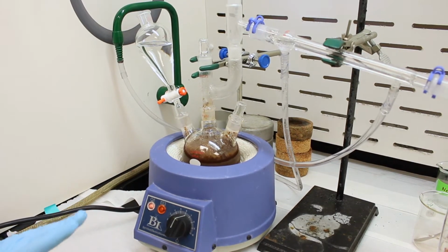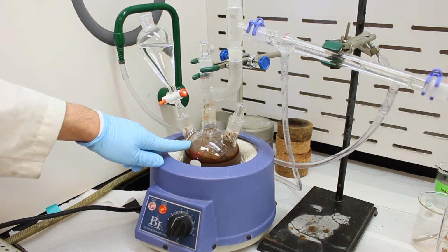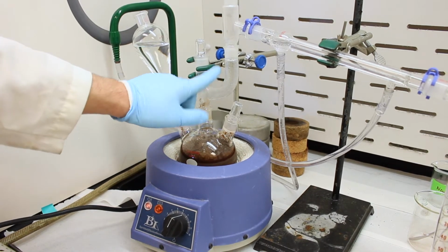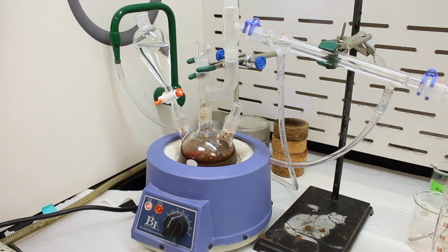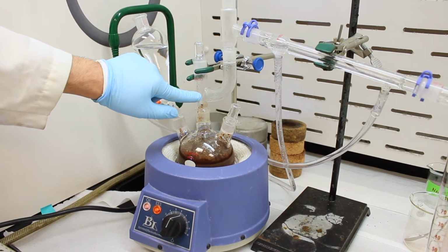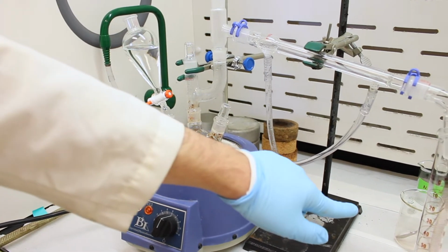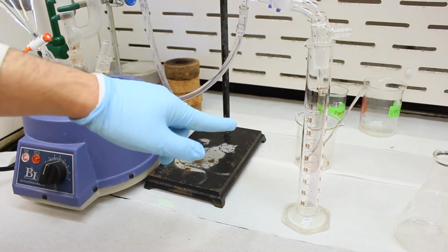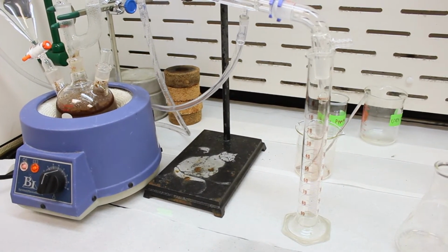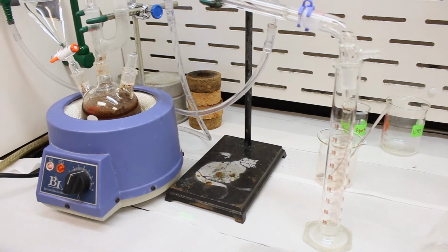Alright, so it's been about 10-15 minutes and our mixture has begun to boil, and as you can see, it is threatening to foam up a little bit. Some of the allspice has climbed the glass, but thanks to the Claisen head, we're probably not going to get a foam over, thankfully. As you can see, the distillate is not perfectly clear like you would see with normal water. It's a little murky, and in the graduated cylinder, where we'll be collecting it, you'll notice it's not just regular water. It's going to look a little bit different in appearance. So we'll come back when we collect enough distillate.